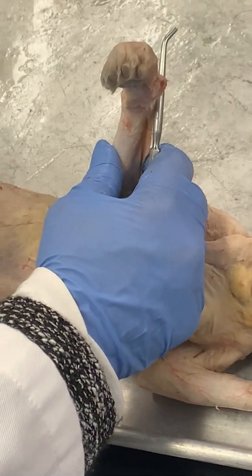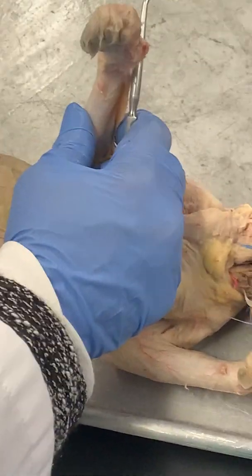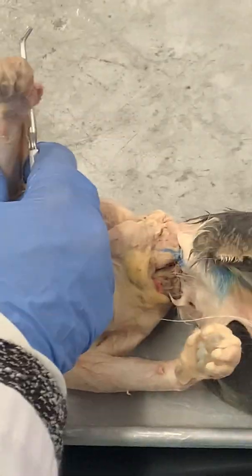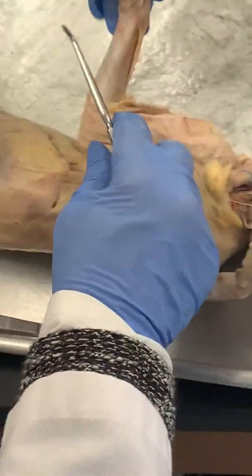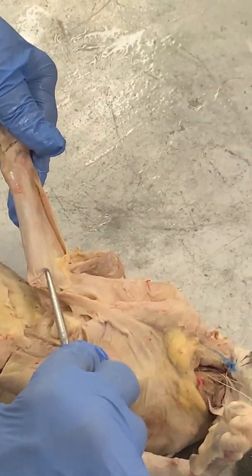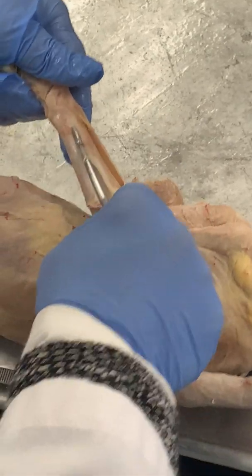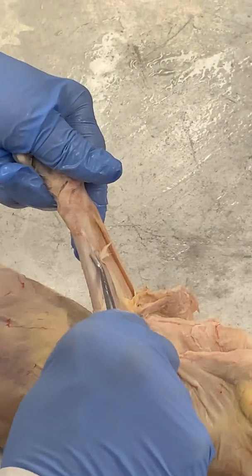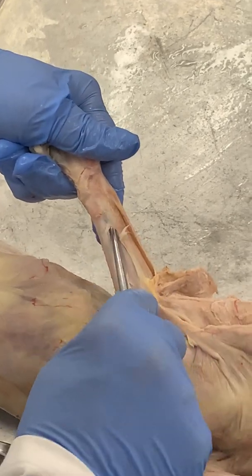I'll do the flexors first, and we'll see the pronator teres too — it's real shiny. So what you want to do, you can kind of see them under the skin — go in with your probe and just kind of rip this fascia. He's a little dry here but that's life in the fast lane.